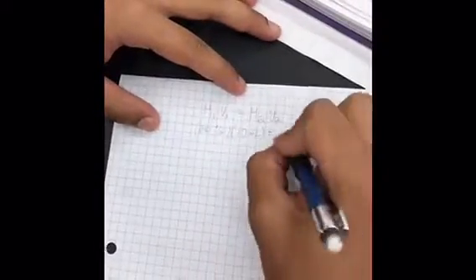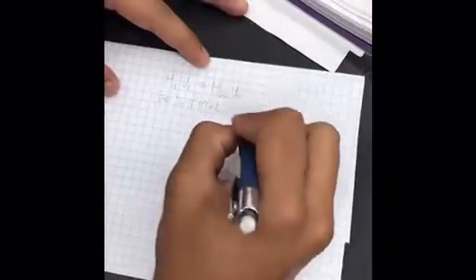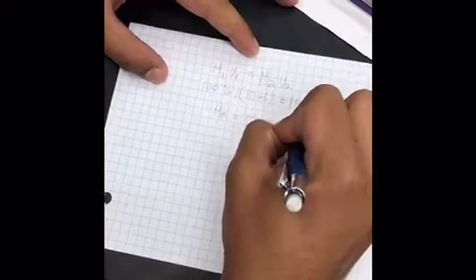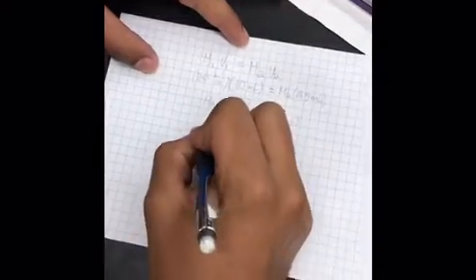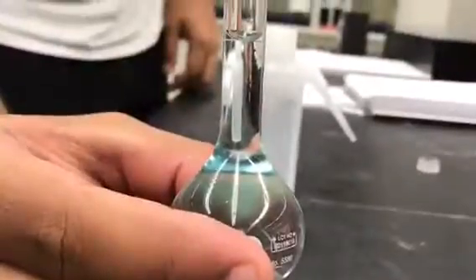So we are looking for our second concentration, and we know that with our concentration flask, we're going to take 25 milliliters. So we leave the second concentration alone, and we take the product over here, over 25 milliliters. So the second concentration will be 8% stock. After we finish diluting in the concentration flask, we have an 8% sugar water.